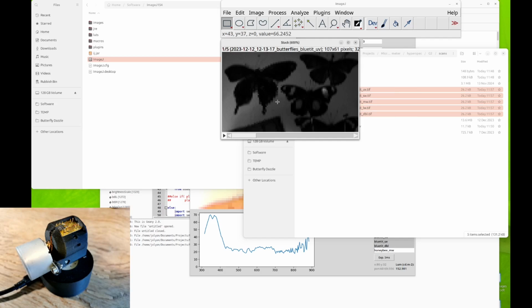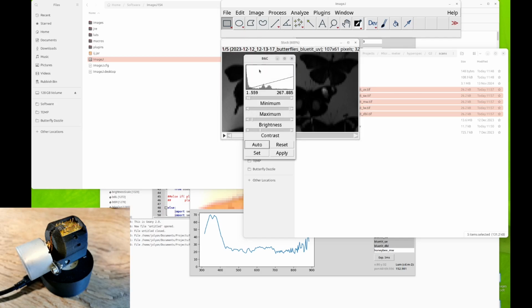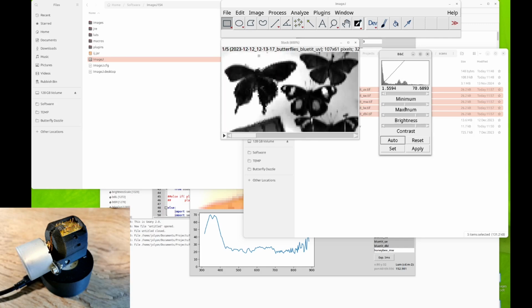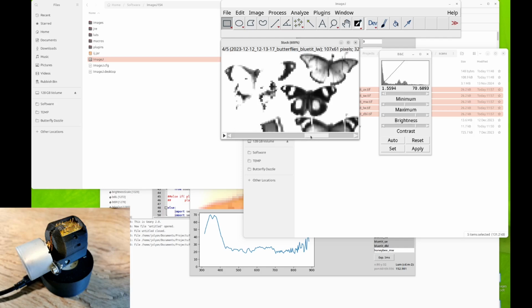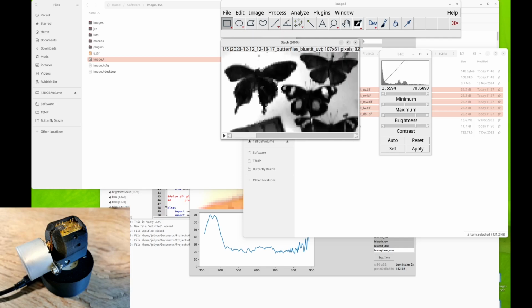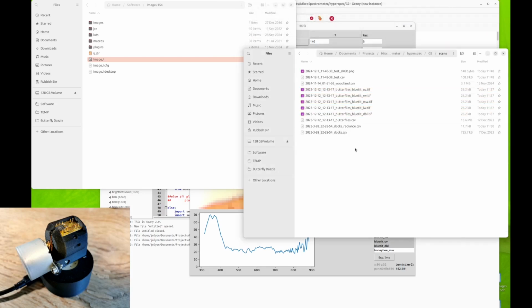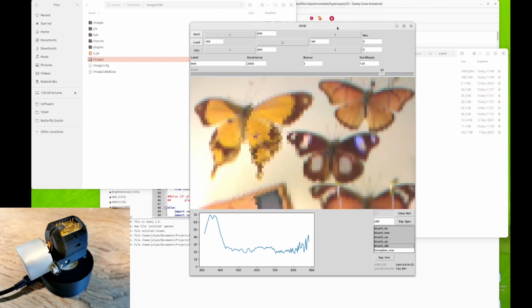and so here we've got the ultraviolet. I can change the brightness of this to show you what it looks like. The ultraviolet cone catch image, short wave, medium wave, long wave, and double cone. And then you can use all of the MICA toolbox related things for cone catch images, and so on. So a nice, straightforward, easy way of getting cone catch information out of the Python system.